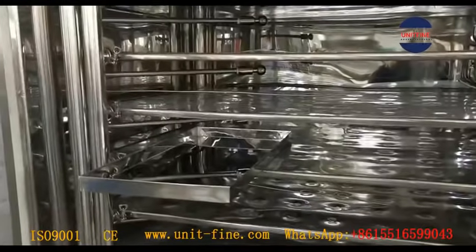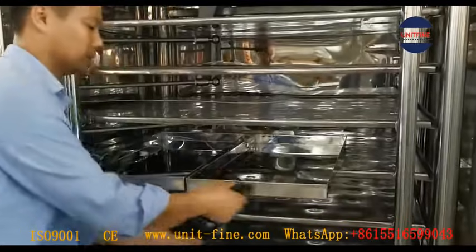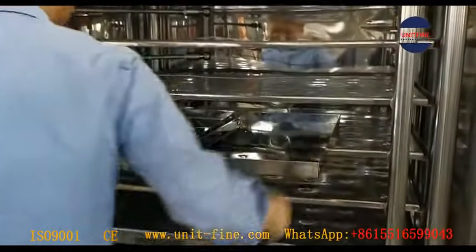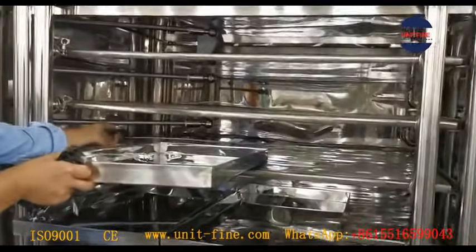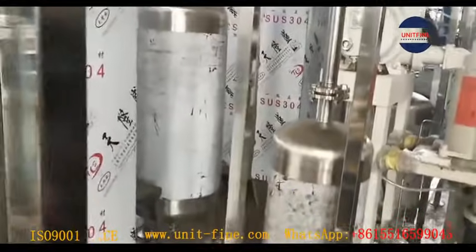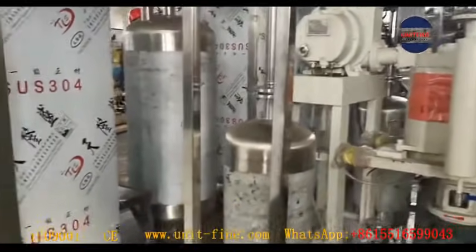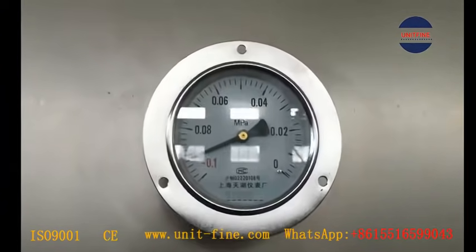Don't forget, the water pressure required is around 2.4 kg. The drying shelf also could be completely removed out for thorough cleaning and servicing. There are 24-piece trays to carry products for drying. All trays are made of stainless steel 316. A flexible temperature sensor is there to monitor the product temperature during the drying process.